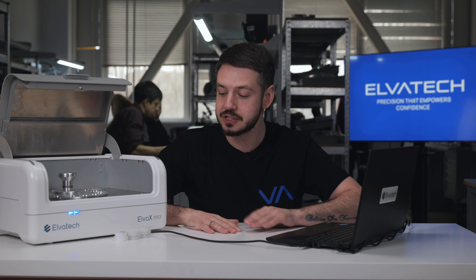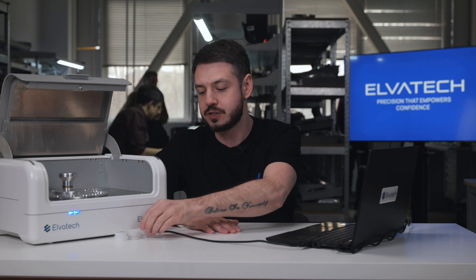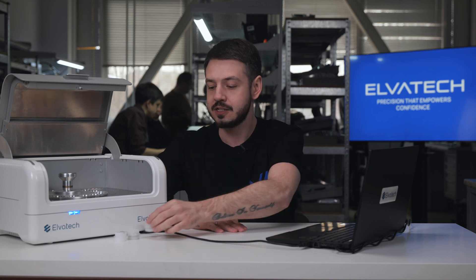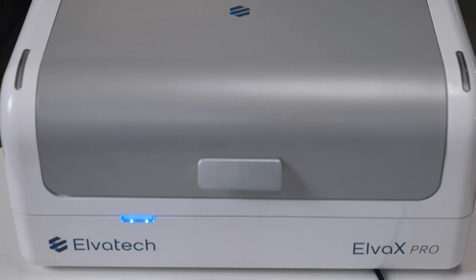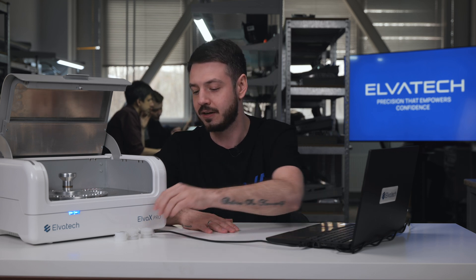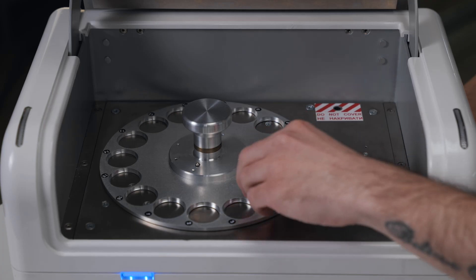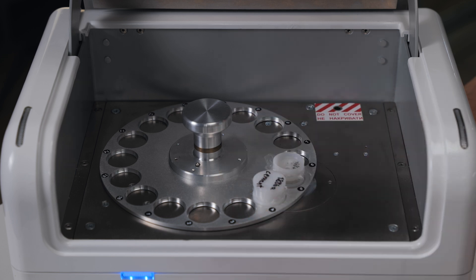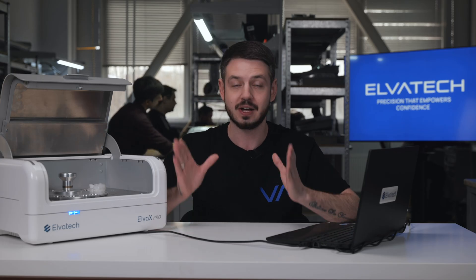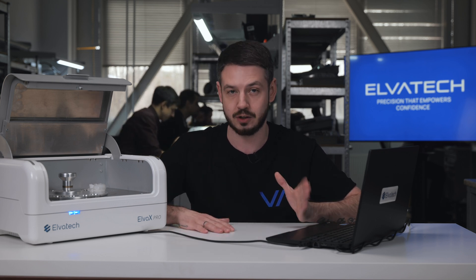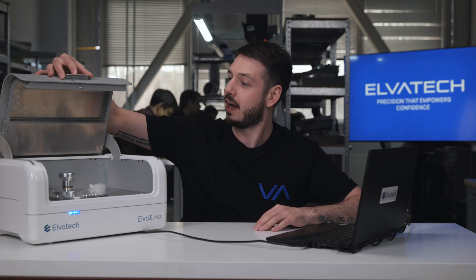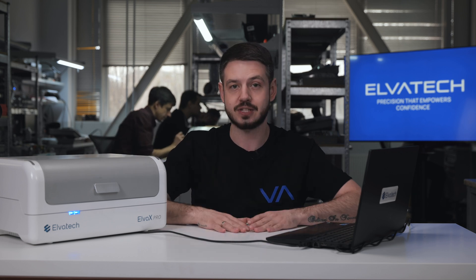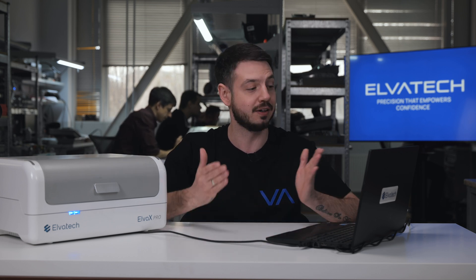Today we will measure our samples in powder form. As you see, we marked them and put them in sample cups, each one with special markings, and we made them ready. Let's just position them in our auto-changer. Let's mark position 4, position 5, and position 6. As we work with multiple samples, this feature is going to be very useful here. After we're done, just close the lid. All additional settings we will configure on our laptop.